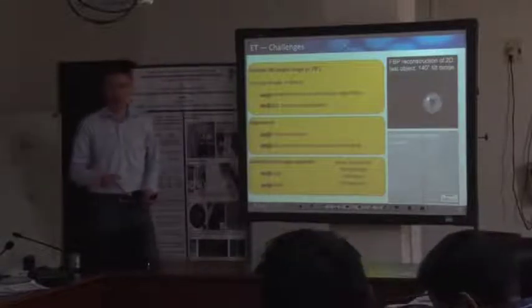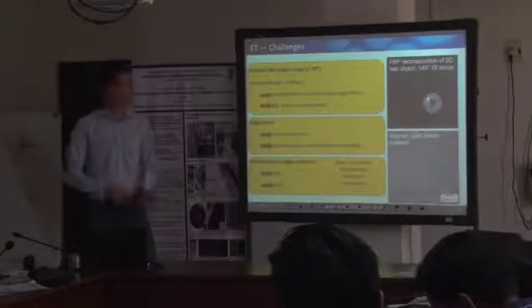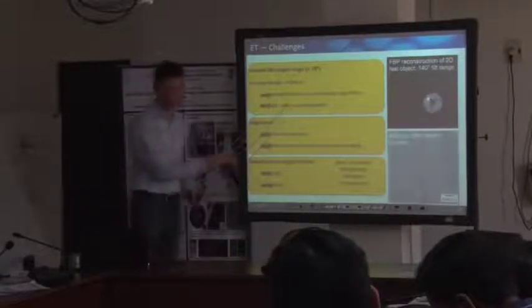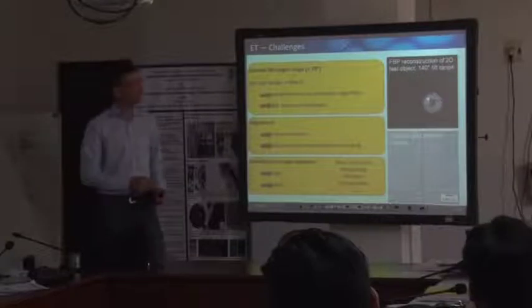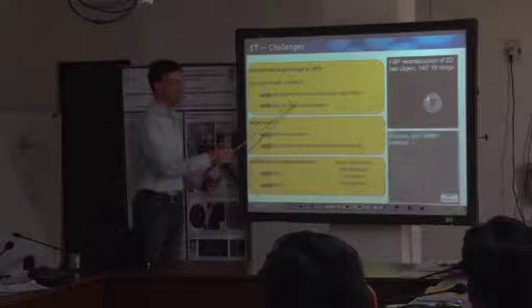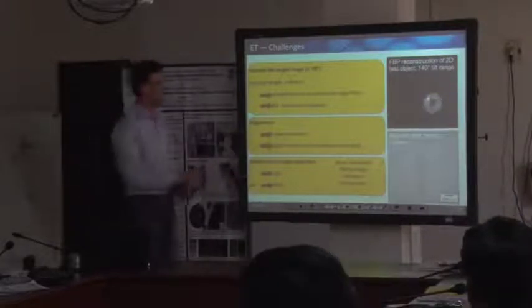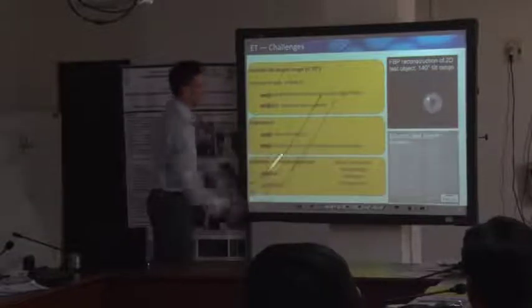This is the minimum, but there are even far more elaborate techniques, like compressed sensing techniques and others. Or you might come up with a 360-degree sample holder, but for some materials this is also not applicable, like for the butterfly wing scale. I mean, this is out of the question. So this was about the missing wedge artifact.